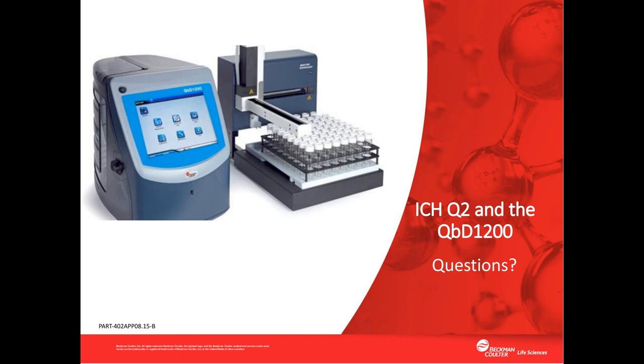Thank you. This is a good question. And I think the basic is that unlike some laboratory TOC analyzers, the QBD 1200 removes the inorganic carbon from the sample first and measures that directly. And then it oxidizes the TOC and measures the carbon dioxide from that. So it's directly making a measurement of TOC using a single sensor, which has an accuracy of plus or minus 2%. So because it's using a single sensor instead of two different sensors, it's not possible for the QBD 1200 to report a negative TOC result because it measures TOC directly rather than calculating it from two separate measurements.